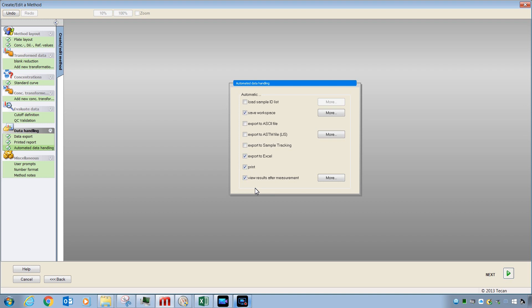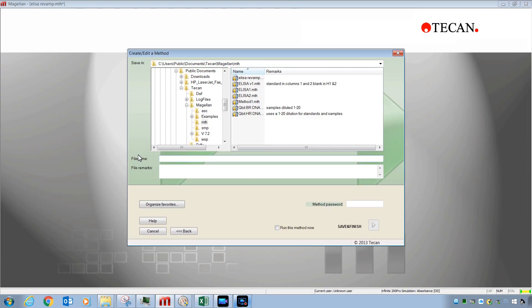Once you're done with these settings, you can move along to Next and then give your method a new name. You can then save and finish and you're done.